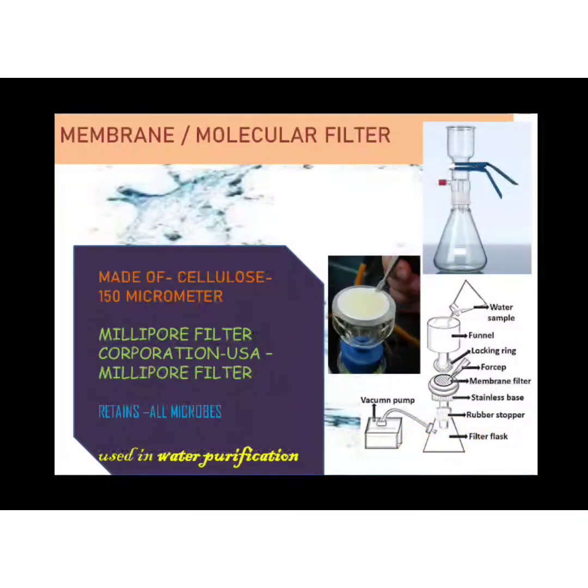Now, what are the advantages and disadvantages? The advantage is that it is a very quick process. Since it is happening through suction, it doesn't take time for the sample to trickle down. It just pulls, it just sucks. Also, it's very easy. Even if there is blocking, I can simply dispose of this membrane filter and use a fresh one. It is very easy to remove the membrane filter and add a fresh one.